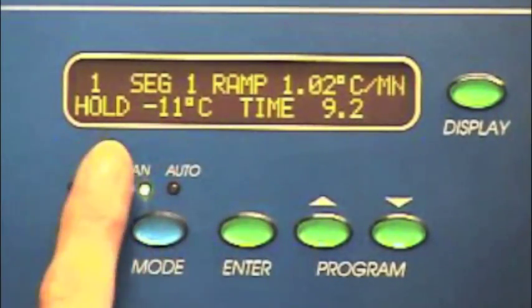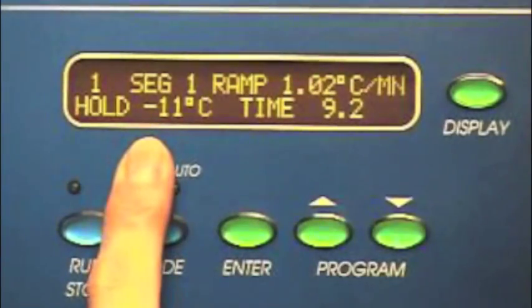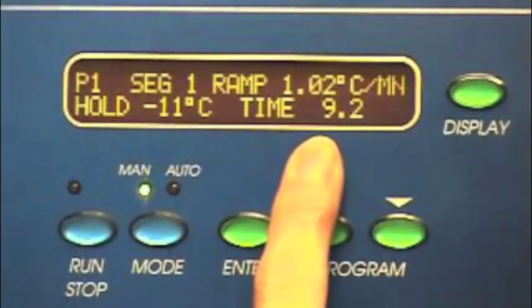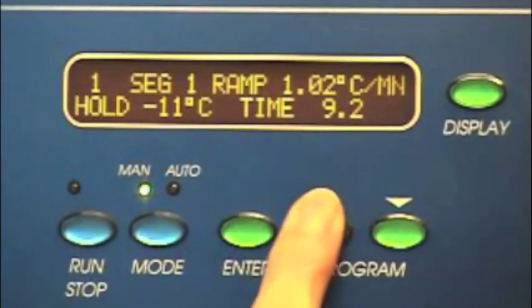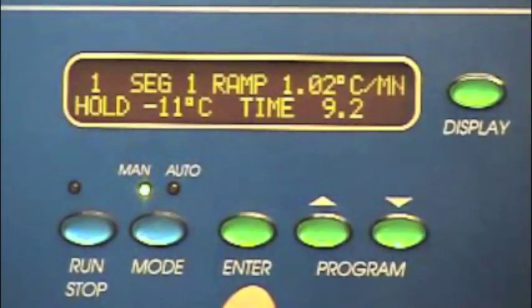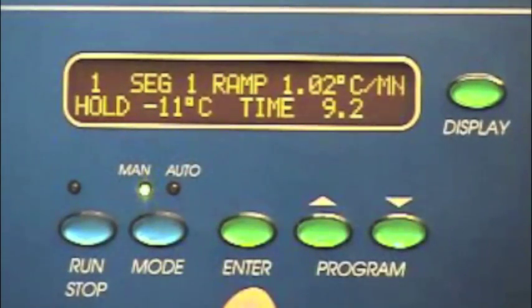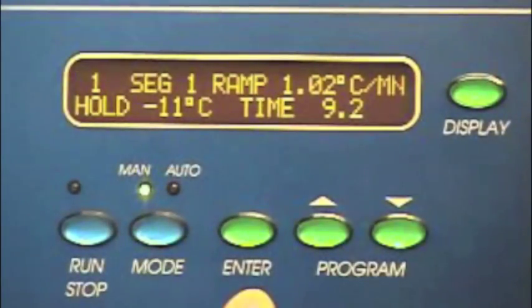Ramp is the rate of cooling or heating on the shelves. Hold is the temperature that the shelves will stay at during a run. Time is the length of time for the selected segment. After entering a value, press the enter button. After 10 seconds, if the enter button is not pressed, it will revert to previous settings.